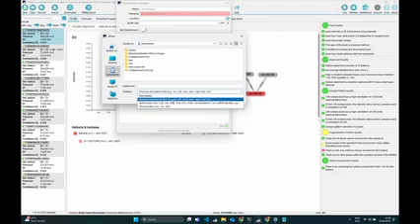This is just for you to find your files more easily. It's just categorizing the file formats, saying am I looking for a structure file or a spectra file. But our database in general does not really care. You can throw a wild mix of all of these files into it, and it will sort out which is which and generate one harmonized database.